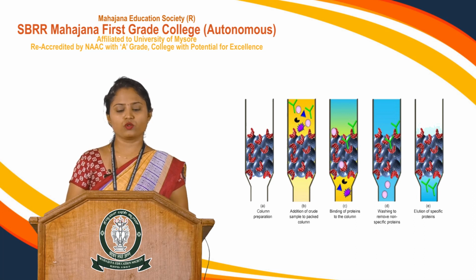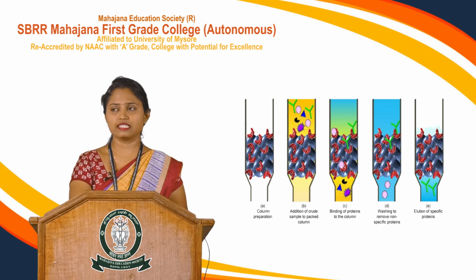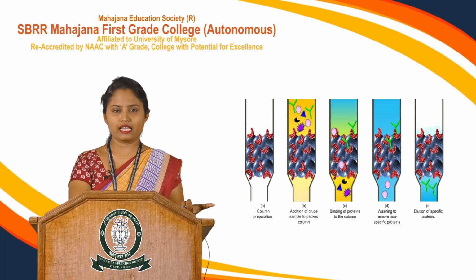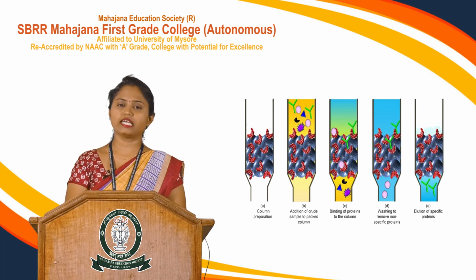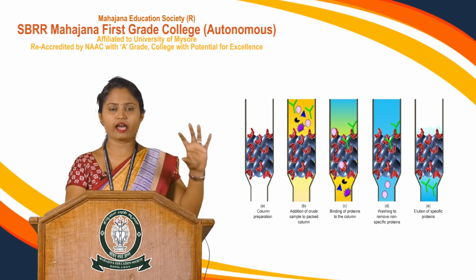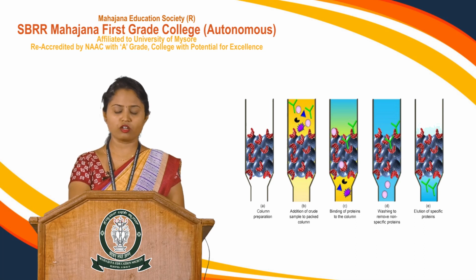For example, you can isolate antigens and antibodies. You can isolate enzymes based on enzyme-substrate interaction, as you know from the lock and key theory, how enzymes have an affinity towards binding a substrate. You can also isolate enzyme-specific inhibitors by using specific inhibitors, and study what kind of inhibitors act specifically on a particular type of enzyme. You can also take hormone receptor concepts.